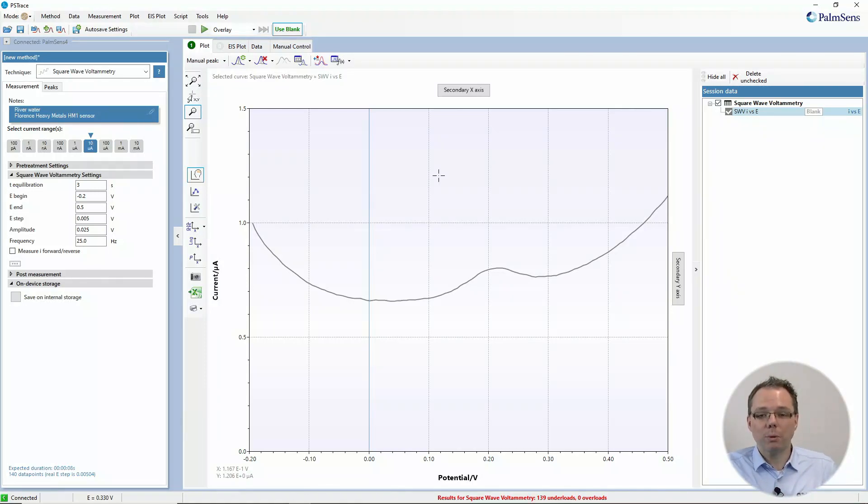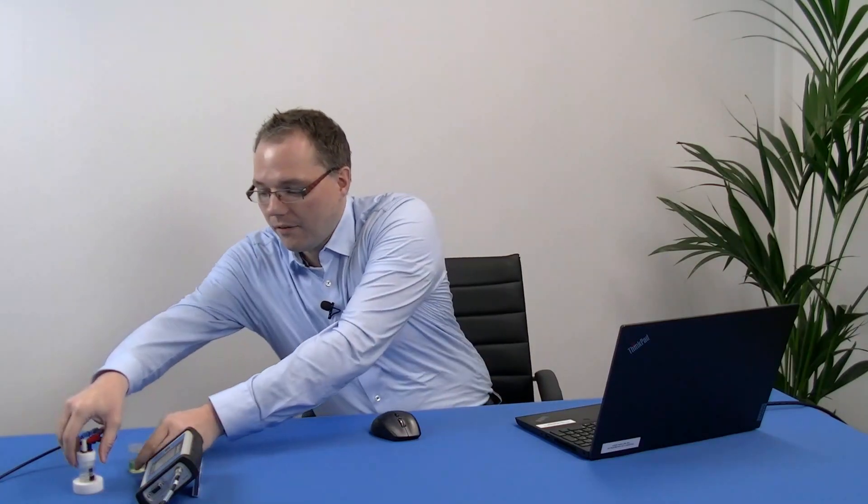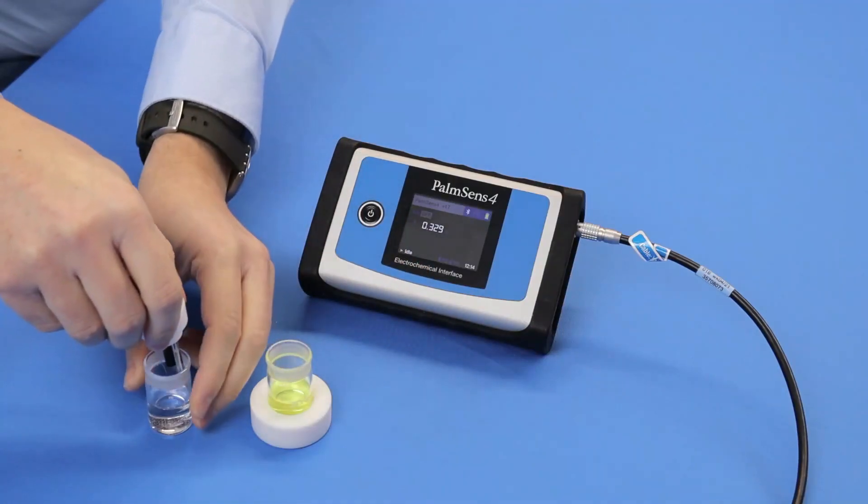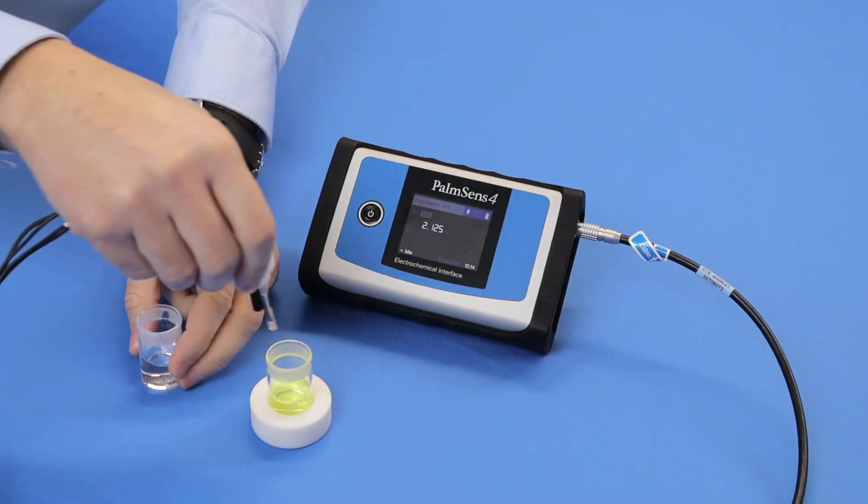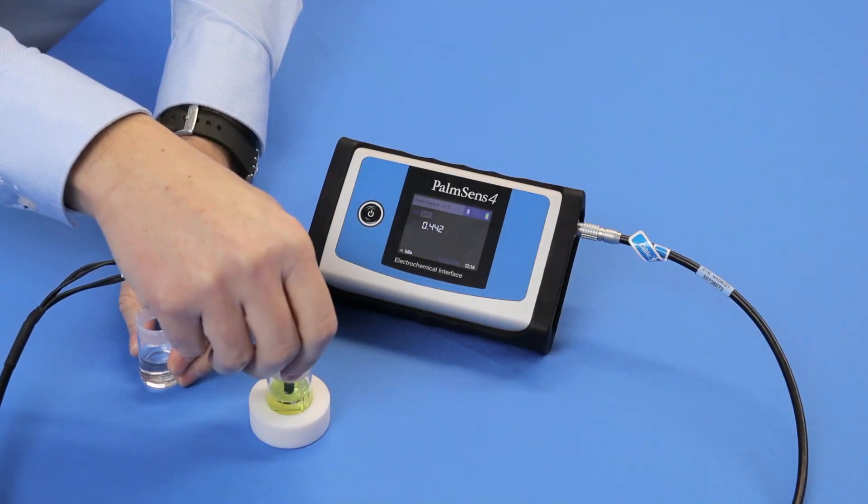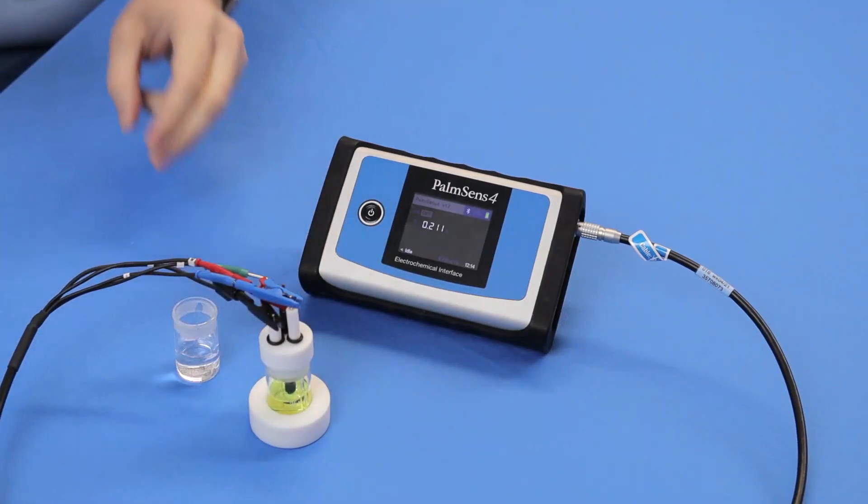Great, now we need to prepare our sample. Of course, I've already done that. I have here a small cell that I've filled with a ferrocyanide solution, and of course that is in potassium chloride, so it's the same solution that we previously had but with the iron complex in it.